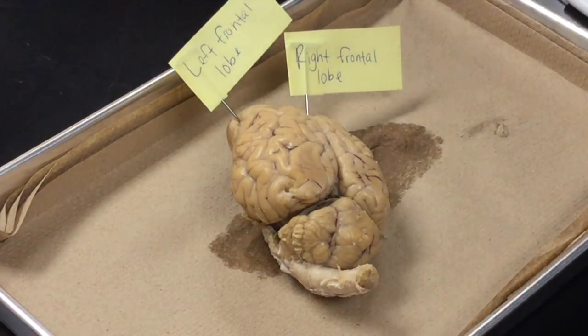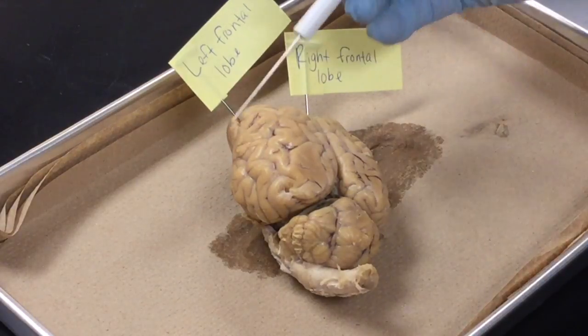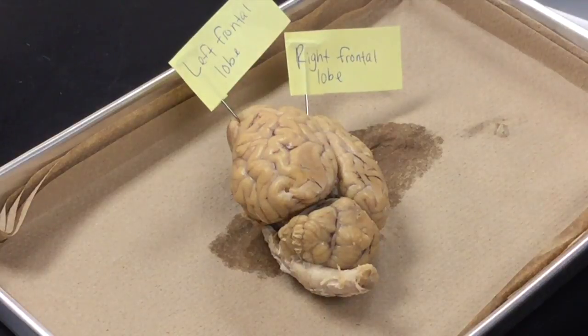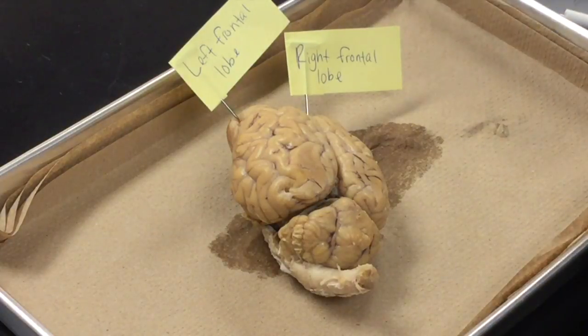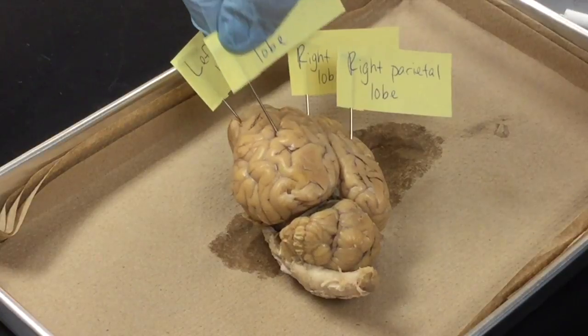Then moving our way back, from the frontal lobes, we have what are called the parietal lobes. Those are located in this particular region on the top part of the brain. So once again, we have the right parietal lobe located here, and then we have the left parietal lobe.